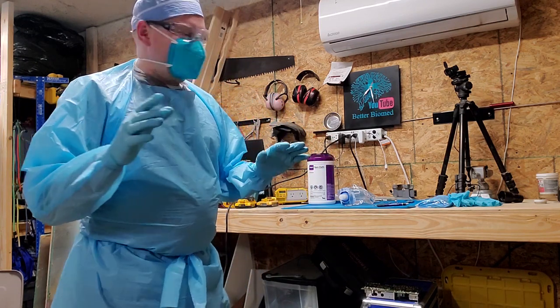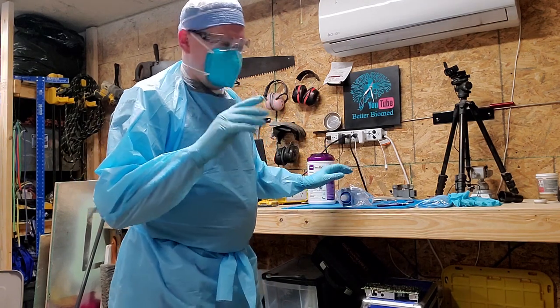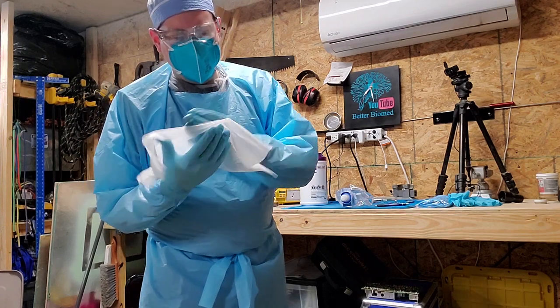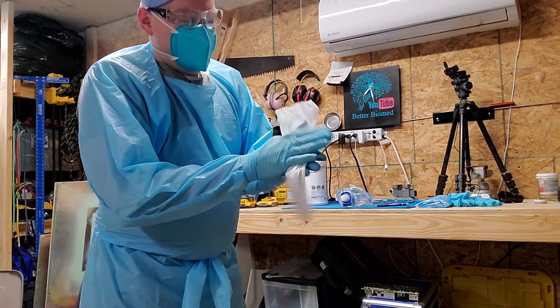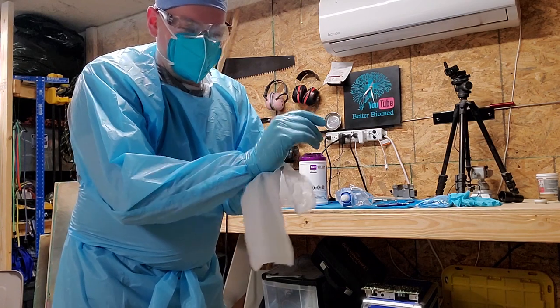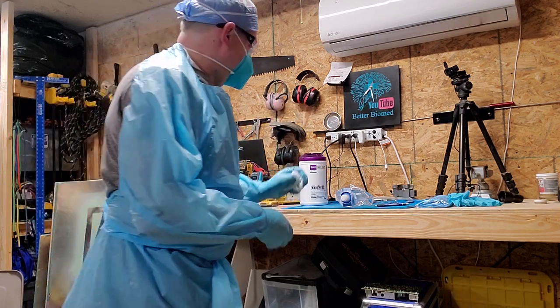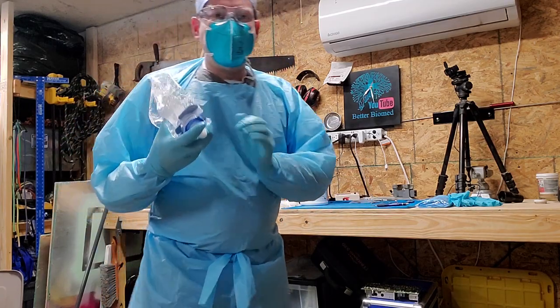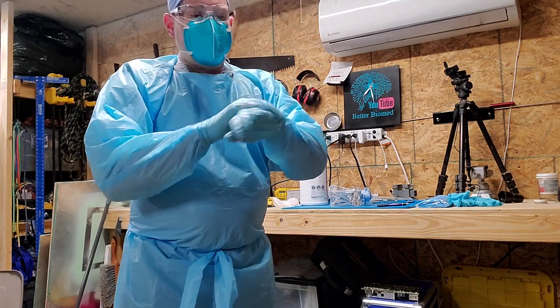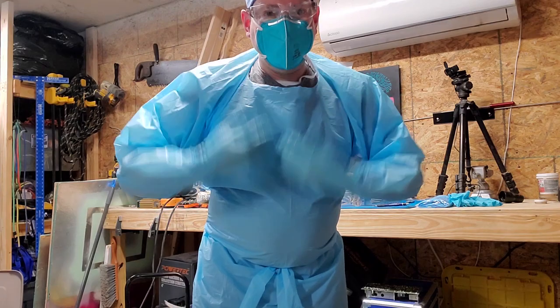Now, when you go to exit a COVID room, the first thing you're going to want to do is make sure that you don't have any blood or anything on your gloves. And if you do, find some wipes around the room and use a wipe to remove any large amounts of particles that are on you. If it's blood, if it's goo juice, you don't know what it is, use a wipe and get a majority of it off. All right? Then find a hand sanitizer around the exit of the room and put some on your gloves. Same thing as if it was bare skin, because what you're doing is killing anything that's on your gloves before you get ready to take your PPE off.